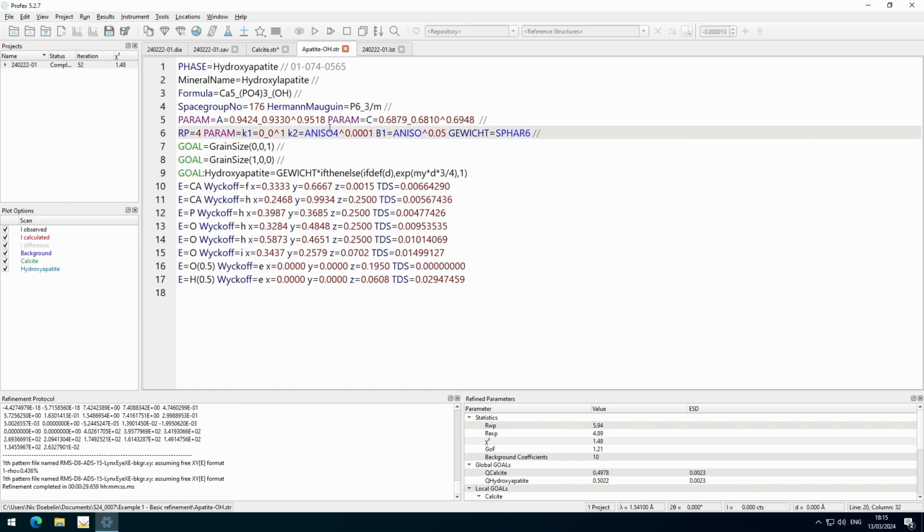And in the apatite structure, we will also implement a simple substitution model that places sodium on the calcium site, Na, and the parameter P is the sodium content on the first calcium site, starting at 0, keeping it positive, and limit at 1 for full sodium occupancy.